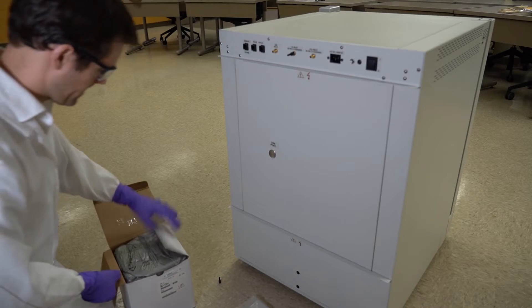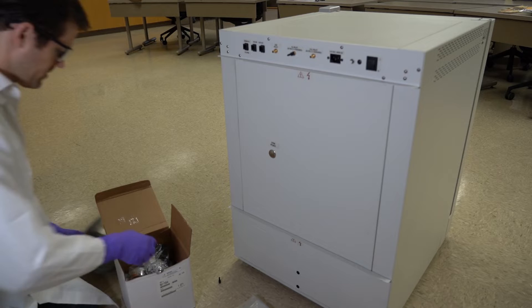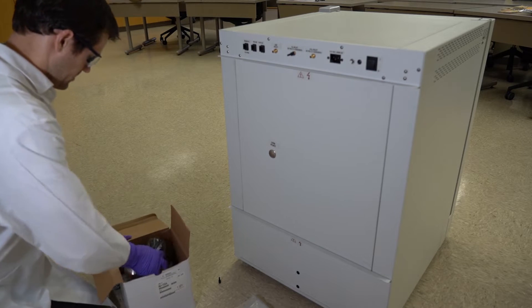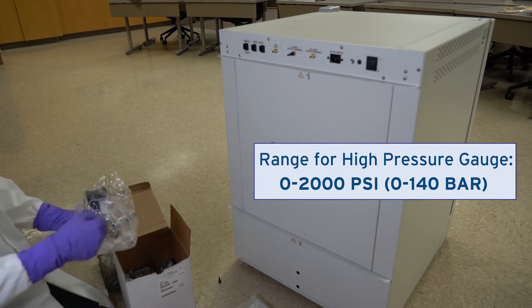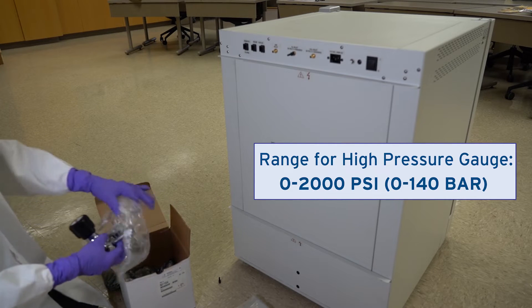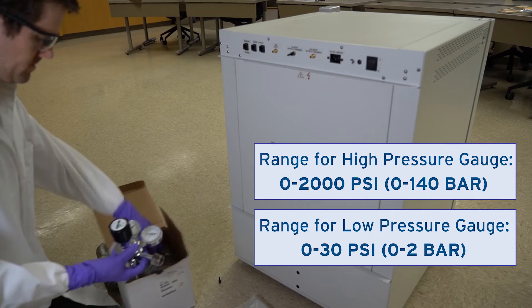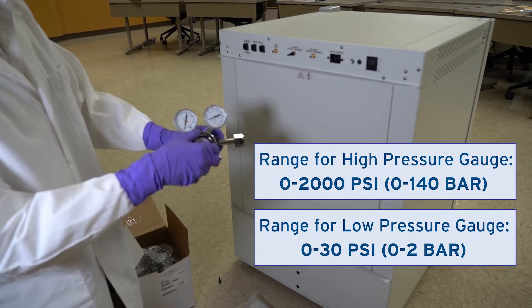You must use a two-stage regulator to ensure that you provide CO2 to the incubator at this pressure. The gauge for the high pressure stage of this regulator should read from 0 to 2,000 psi or 0 to 140 bar. The gauge for the low pressure stage should read from 0 to 30 psi or 0 to 2 bar.